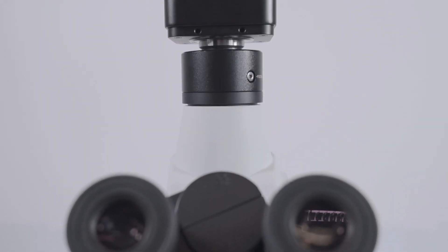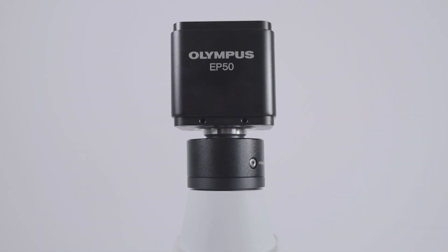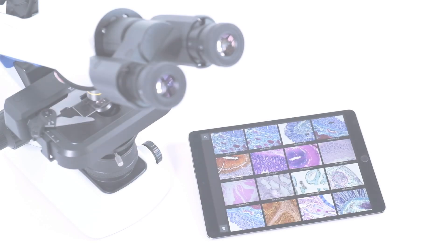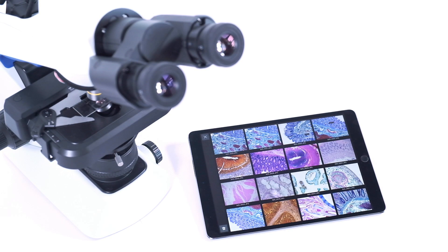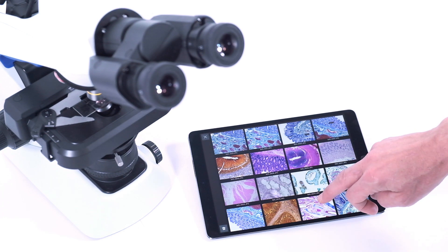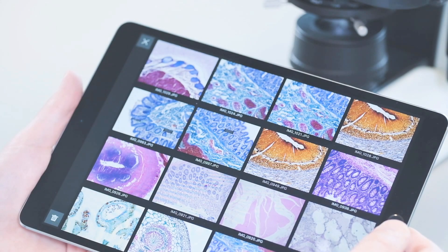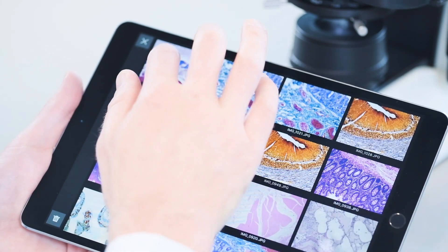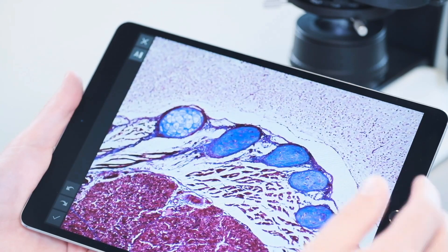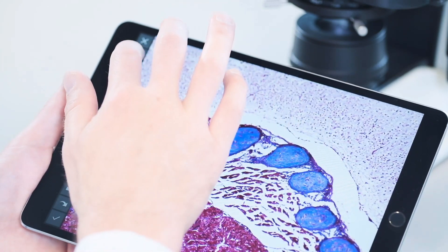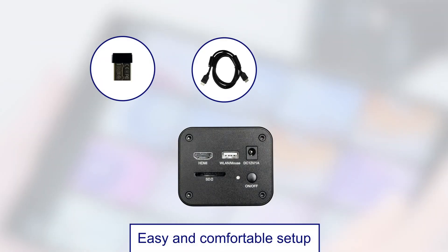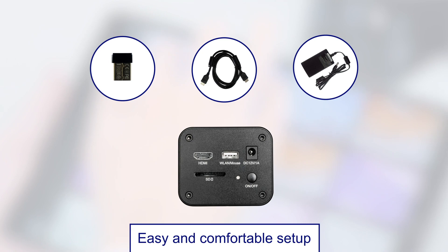Equipped with the WLAN-capable Olympus EP50 camera, every microscope in a classroom becomes a wireless imaging system, enabling lecturers to teach and students to learn in an engaging digital environment. Setting up the camera for WLAN mode control is easy and straightforward.